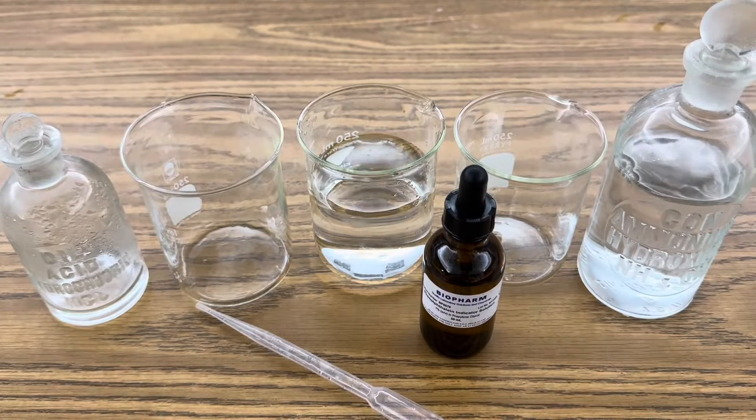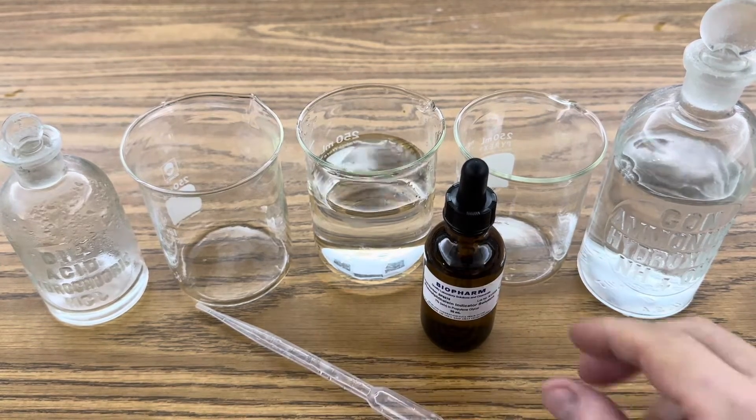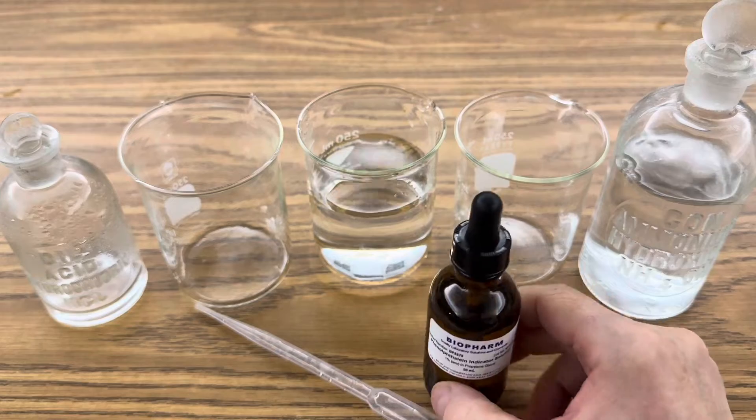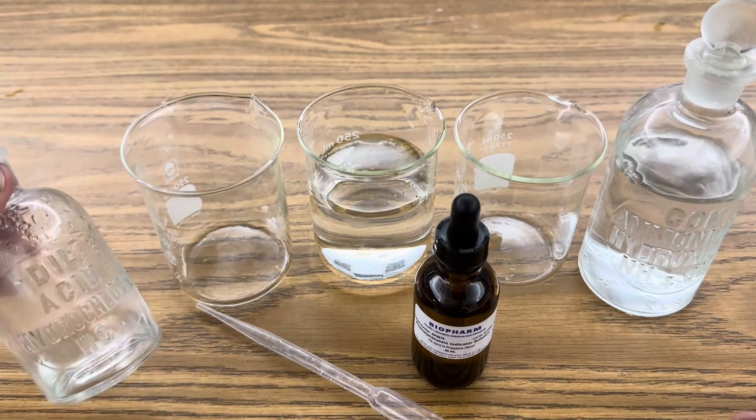All I'm using in this demonstration are three beakers. One has some water and the other two are empty. I'm using phenolphthalein as an indicator, ammonium hydroxide, and 12 molar hydrochloric acid.